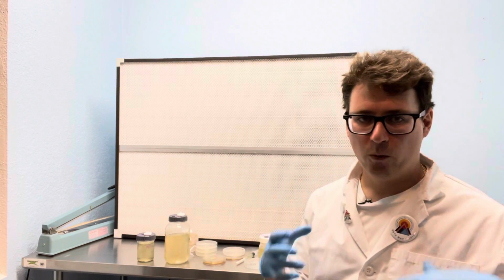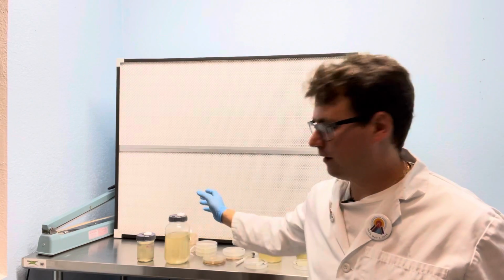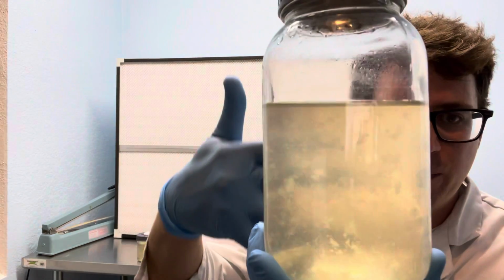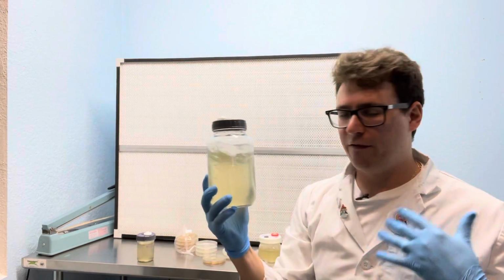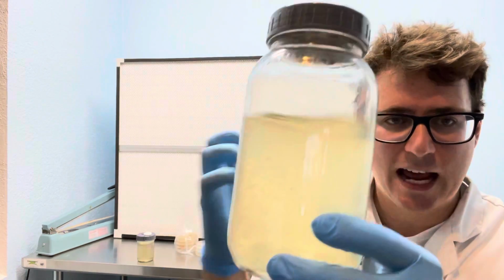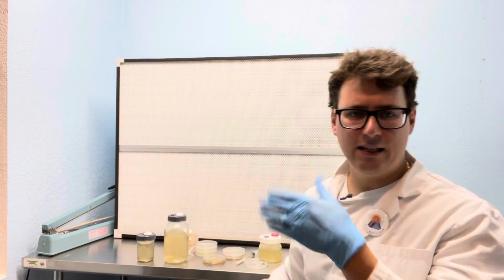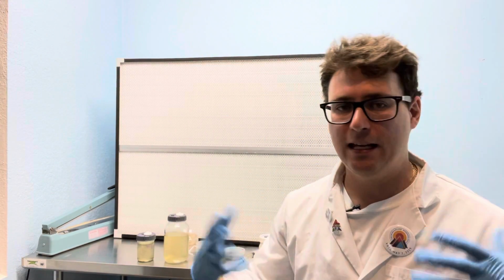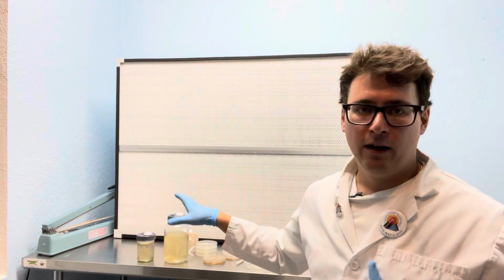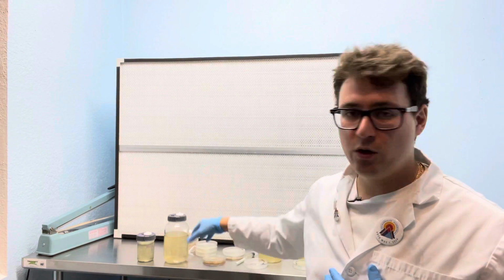When you are observing a liquid culture, you're going to want to look for clearness. You can see my hand pretty clear on the other side. If there's any yeast or any bacteria present, it's going to be a very dense and cloudy solution. You won't be able to see all the way through it because the cells are replicating and eating up those nutrients and creating a barrier for the light to pass through. That's the number one observation for liquid culture. Sometimes you can smell if there's contamination, because it's such a nutritious substance that it will rapidly produce bacteria.